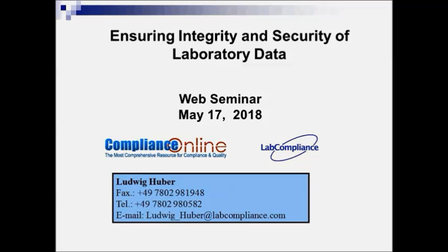This is a presentation about the integrity and security of laboratory data to comply with FDA and international regulations, such as 21 CFR Part 11 or European PICS GMP Annex 11, so I will mention both. This presentation should give you a good understanding of the FDA and international requirements, and I will give recommendations and also show you tools to implement those requirements.